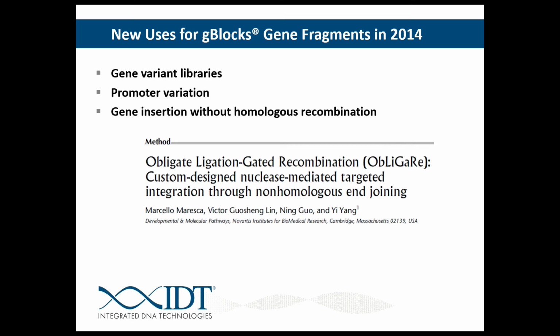transfect in a high number of fragments of DNA, so that when this double-strand break is created and the non-homologous end joining method basically grabs ends and begins gluing them back together, there's enough inserted DNA in there that it actually gets inserted in between the break. And so by doing this, you end up getting an insertion of DNA in there. Now, you can't control the direction of the insertion, so it can go in either direction, but you can get a nice insertion of DNA.